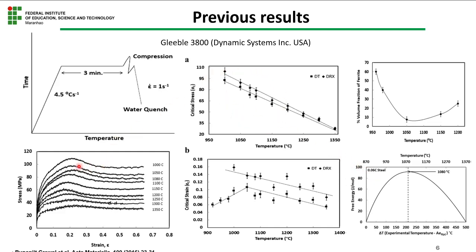When you take this stress from the curves and trace a line over to the x-axis, we see the related strain to that stress that we found.